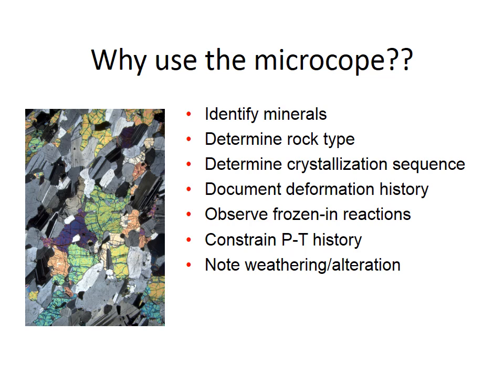Everyone. Welcome to anisotropic minerals. First, we'll do a little review from yesterday's brief look that we did in lab, and I'll show you some basic information about how anisotropic minerals appear under the microscope and how we can interpret what we see there.